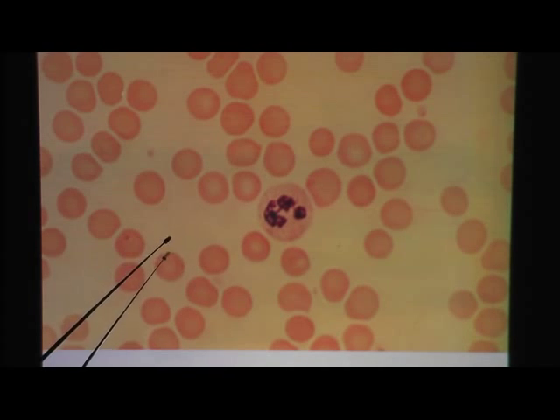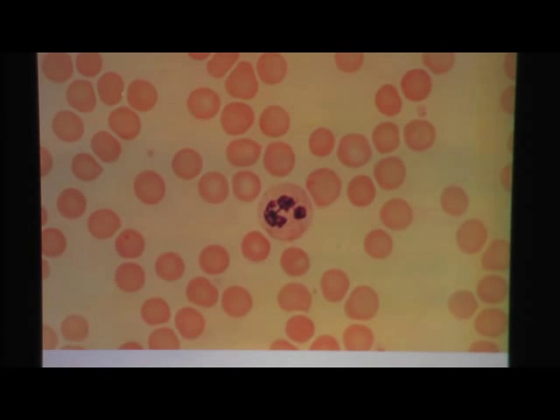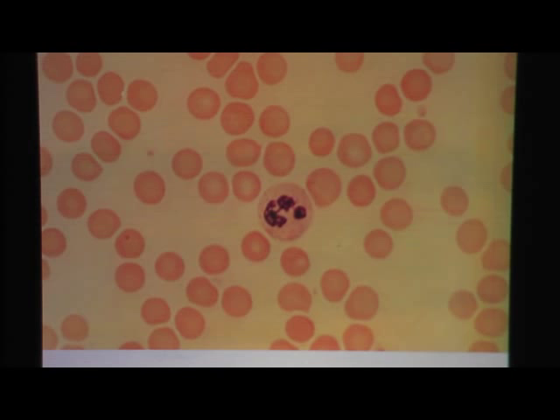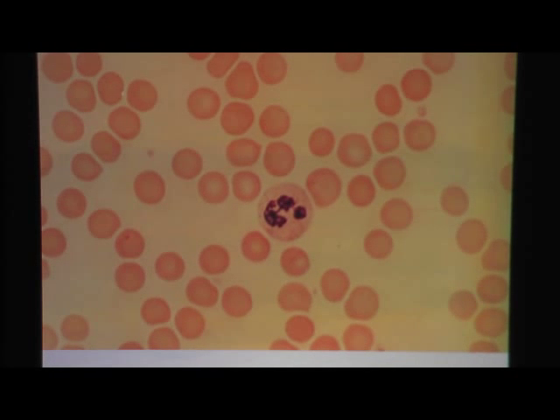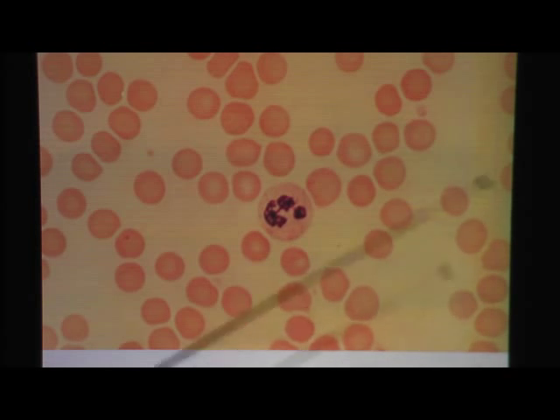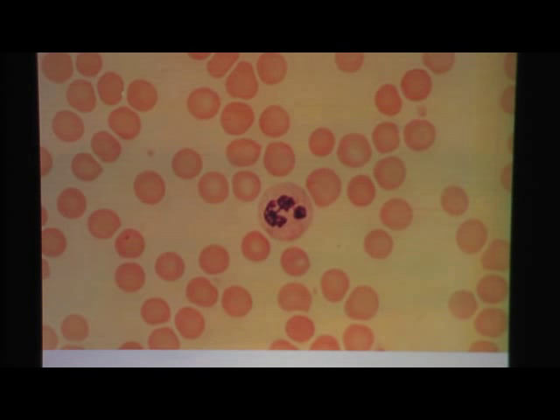Sometimes the stain is a little different — more orangey than red. So here, same thing: red blood cells, that's a white blood cell, and in between would be plasma. I want to remind you, red blood cells are unique in that they do not have any nucleus — none of these red cells have nuclei, and that's normal. A red blood cell's job is to carry oxygen, so it loses its nucleus to make more room for hemoglobin to carry more oxygen. It's just a circle with no nucleus, no organelles visible.